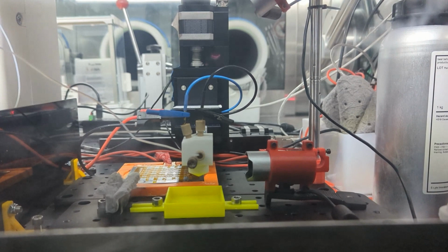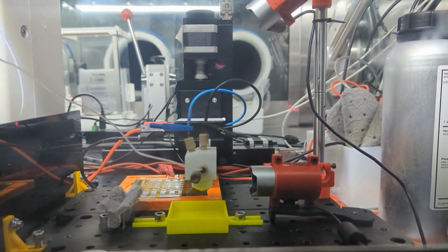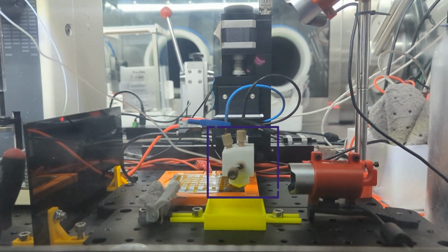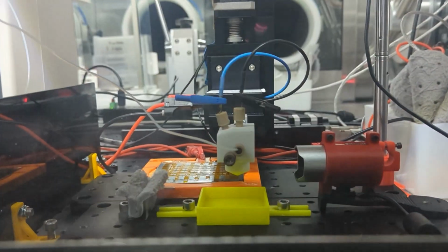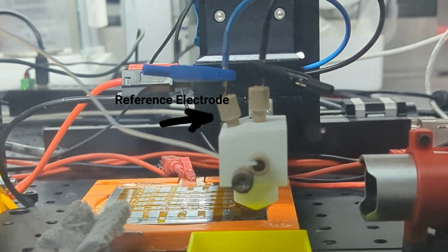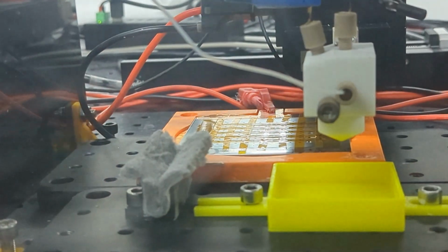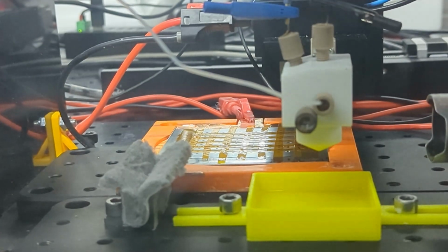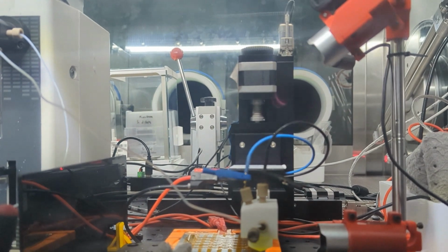The device hub in Auto-MISCHBARES consists of several devices that collaboratively perform experiments. At its core lies a miniaturized 3-electrode cell setup known as a scanning droplet cell, or SDC. This setup includes a working electrode, a gold reference electrode, and a counter electrode made of platinum. These electrodes are positioned within a cell housing made of PTFE and are movable via a stepper motor from Ovis company to facilitate various electrochemical protocols.